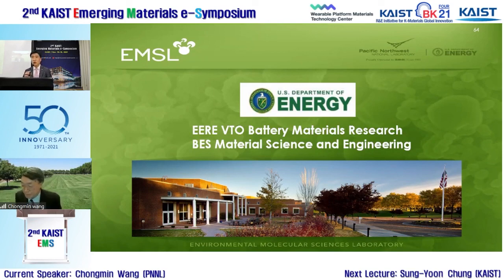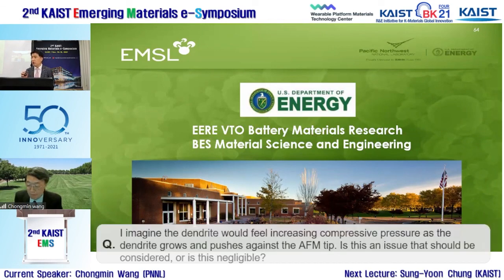Thank you very much for the beautiful presentation. We have 4 questions, but due to limited time, I will introduce 2 questions. The first question: thank you for a great talk. The environmental TEM with the AFM tip is a fascinating characterization approach. I imagine the dendrite would feel increasing compressive pressure as it grows and pushes against the AFM tip. Is this an issue that should be considered, or is this negligible? Thank you for your insight.